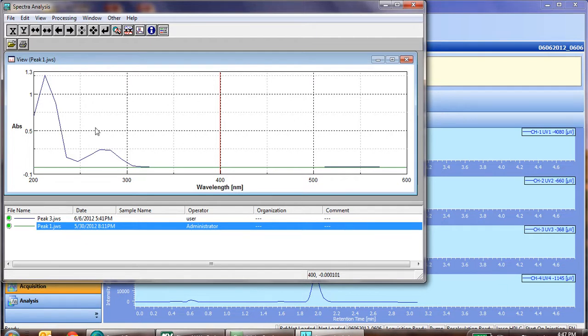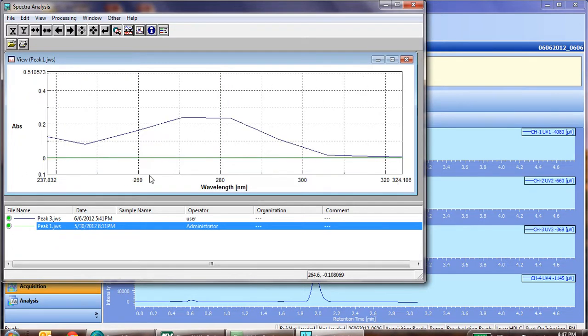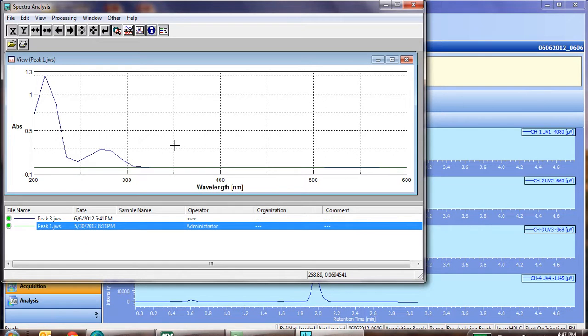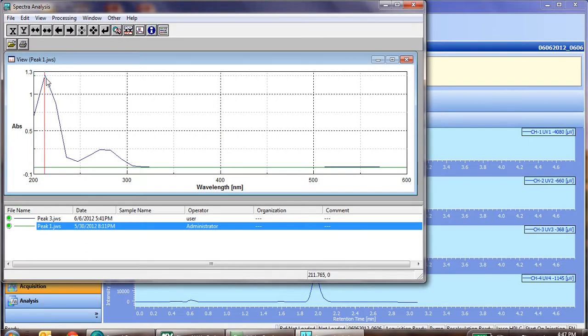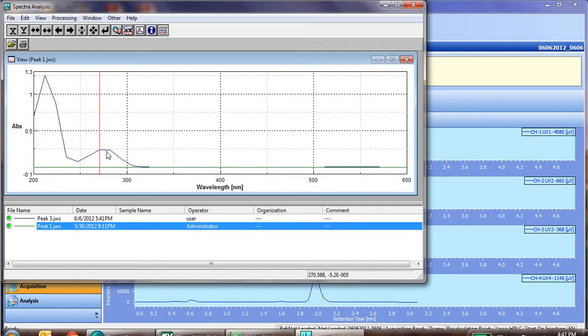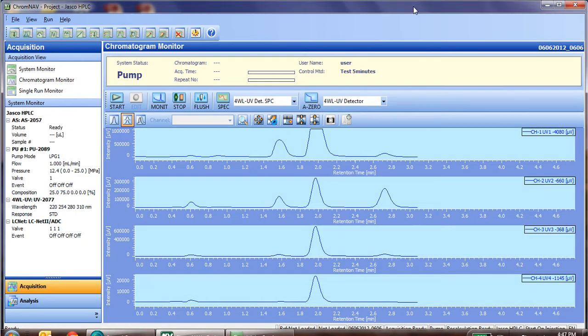Once you're finished with this analysis, you can of course close it. A few other things you may want to do, you can zoom in on certain regions. In this case, we could say, by clicking, or unzooming, and clicking, that our particular wavelength, that's the strongest, is 211 nanometers. Another good wavelength, 270 nanometers.